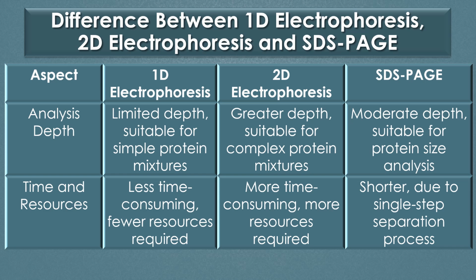Time and resources. 1D electrophoresis requires less time and fewer resources. The 2D electrophoresis is more time consuming and requires more resources. SDS-PAGE is shorter due to the single step separation process.